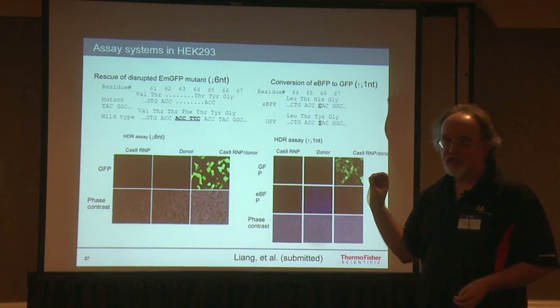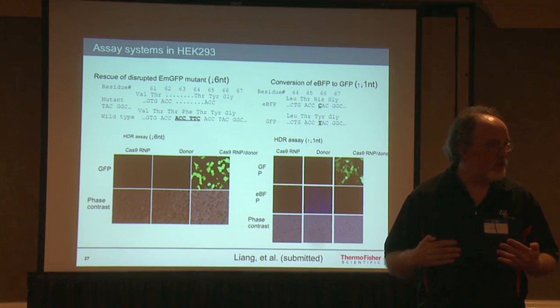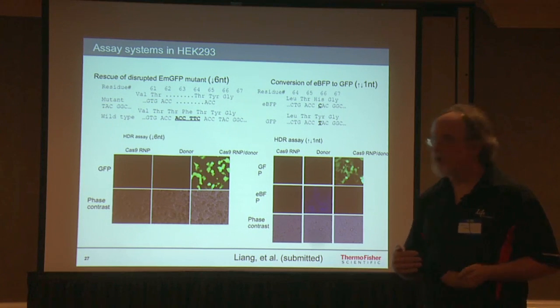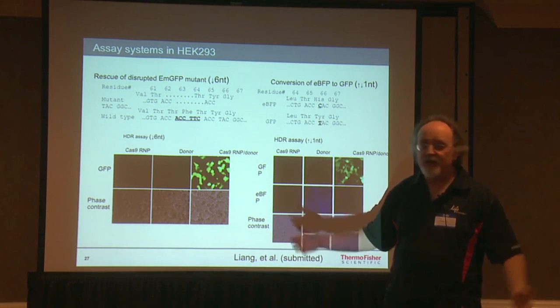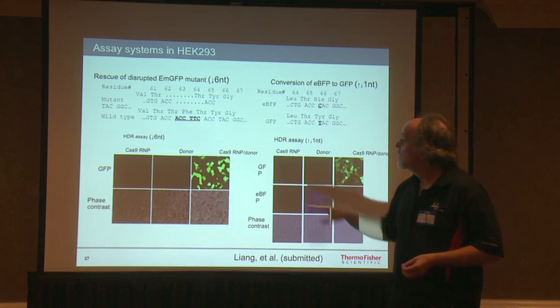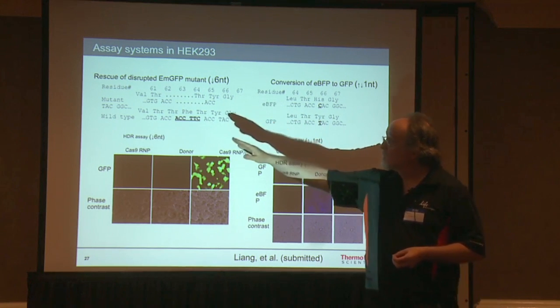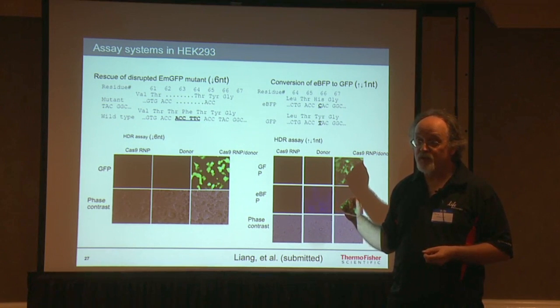The cool part about this is that because we've spent so much time characterizing and validating the workflows for knockouts, it has made the process of doing knock-ins much easier. Because we've worked out the rules of how a knockout is done and how to join 2 pieces of DNA together using homology-directed repair, in these 2 experiments we've got the same cell line, and in both cases we're introducing a new type of fluorescent protein and looking for the presence of that fluorescent protein within the cell line.